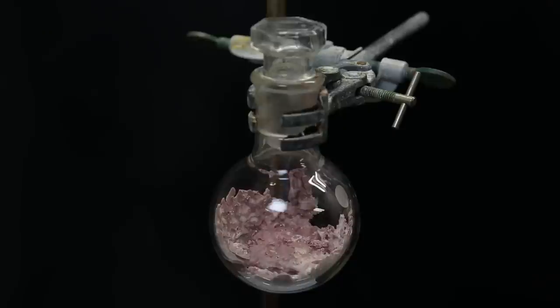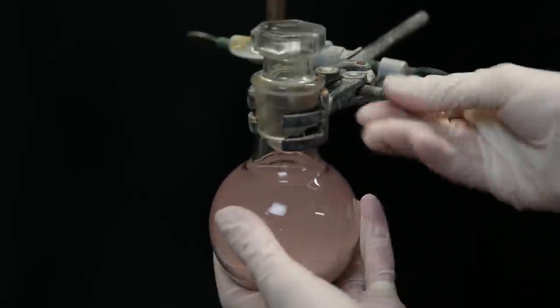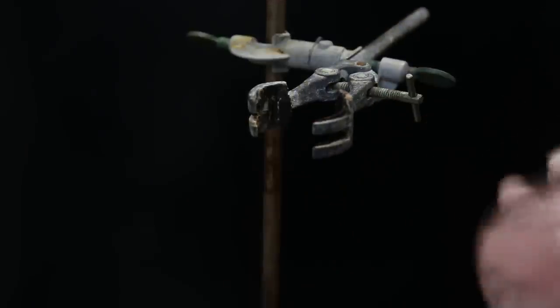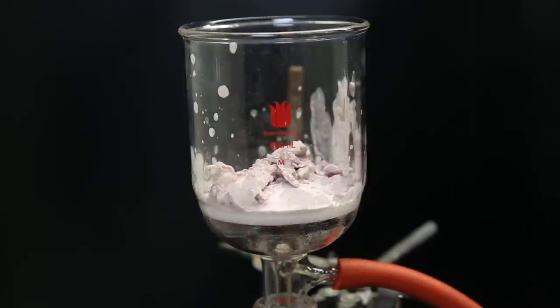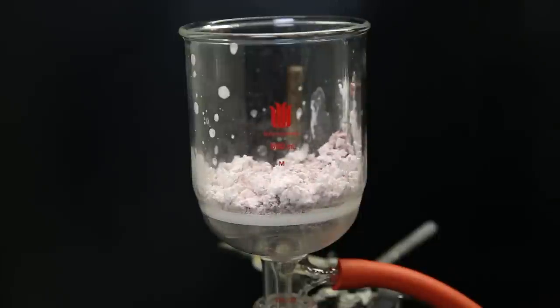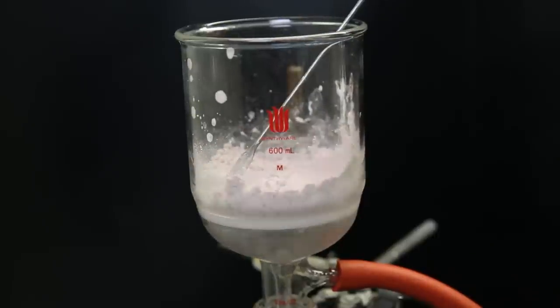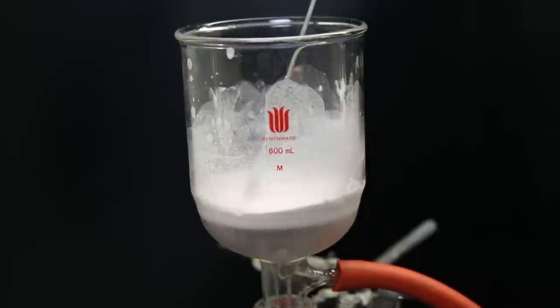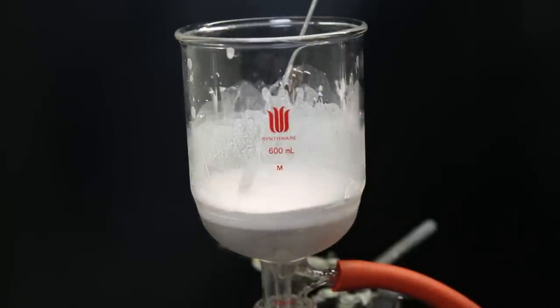Now to remove this impurity, I add 200 ml of diethyl ether and shake the flask to make the solid come loose. We see that the colored impurity dissolved and colored the solution red. Now I filter the mixture through a glass filter to collect the solid, but the solid is still a little bit pink from the impurity. So I wash it twice more with some diethyl ether. This has gotten rid of pretty much all of the pink impurity, and I leave it to dry on the filter for a few minutes.